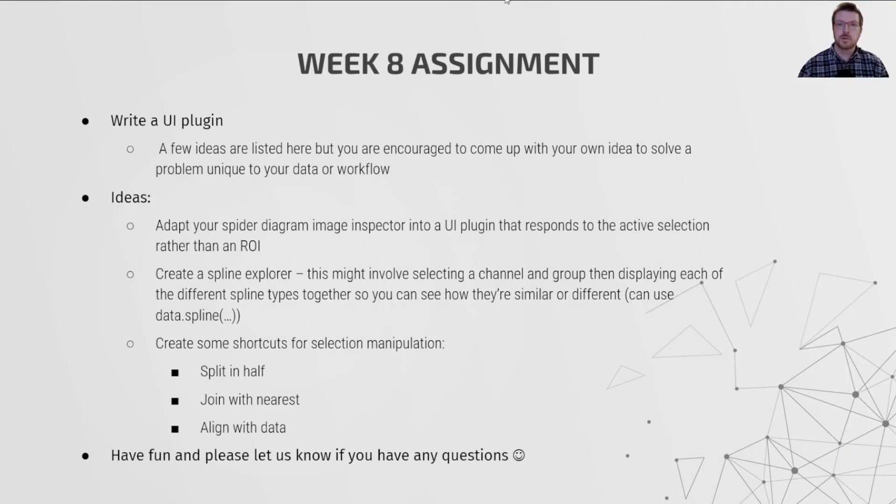or create a spline explorer. For this, I was thinking you could select a channel and group and then display the splines generated for each spline type. This would allow you to see how similar or different they are. Note that there is a function, data.spline, that you can use to calculate the splines.